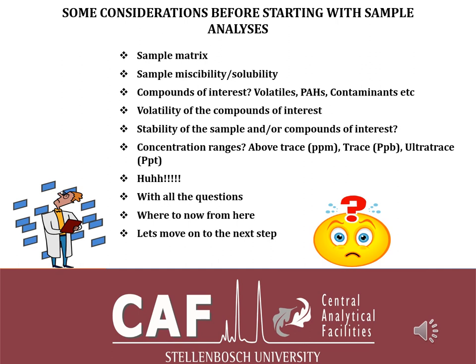And also, it's important to know the miscibility of your sample. Is your sample soluble in an organic solvent or an inorganic solvent? If it's an organic solvent, is it polar or non-polar? Because that will help determine which solvent to use.